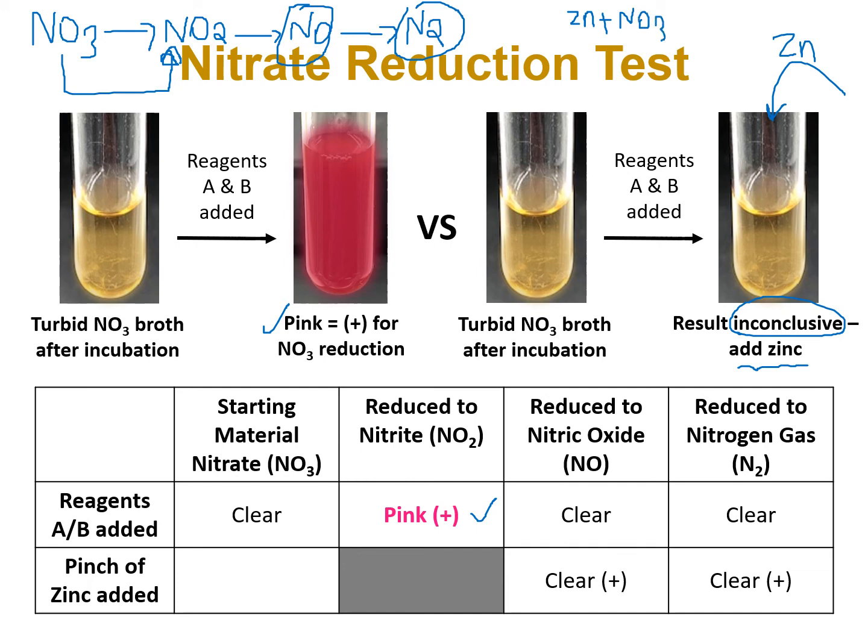Now, when you add zinc to nitrate, zinc basically acts as a catalyst, and it's going to help the reduction of nitrate to nitrite.